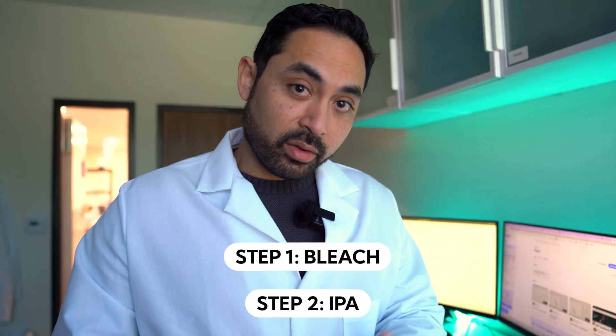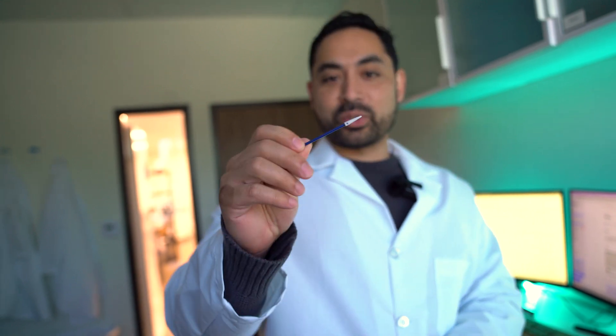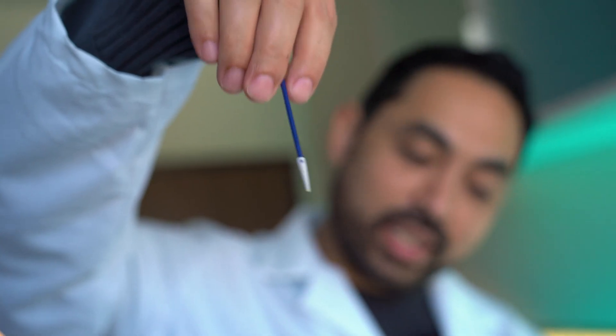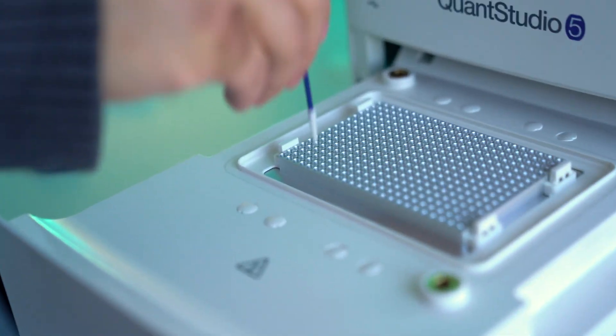You're going to want to start with 5% bleach and you're going to want to use these. Have you seen this before? This is like a PCR q-tip. These are kind of cool. You can take a look. They're pointy and they kind of fit in the wells perfectly.